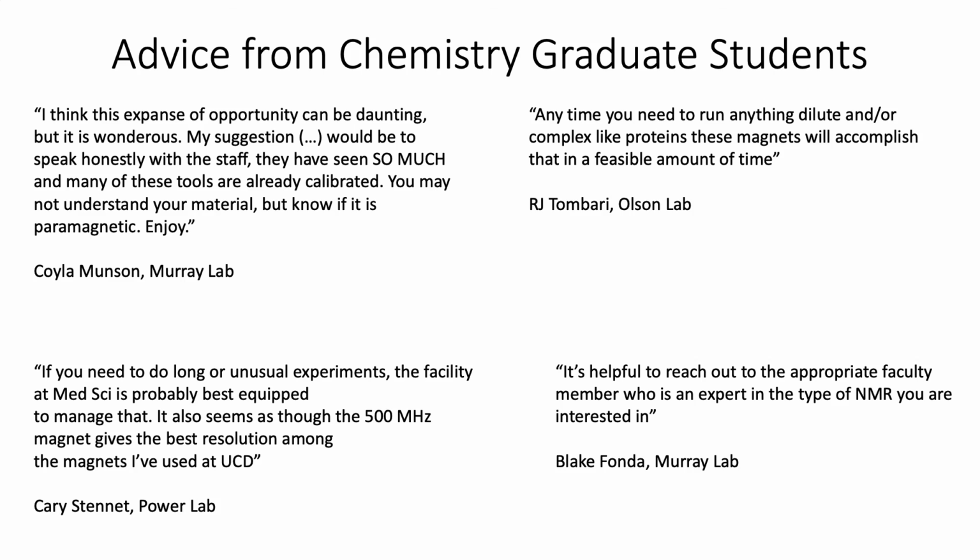Now that you've seen some examples of research done in the MedSci facility and what the potential benefits of using that facility are, I wanted to round off this talk with some advice from chemistry graduate students that have used the facility that I collected feedback from. Feel free to pause this video and read as you wish.